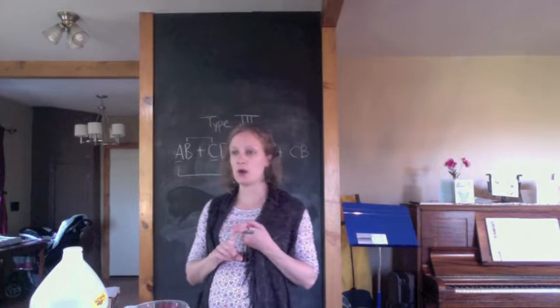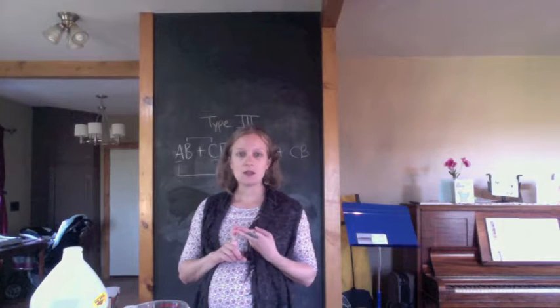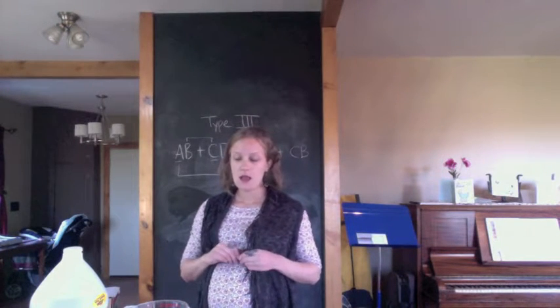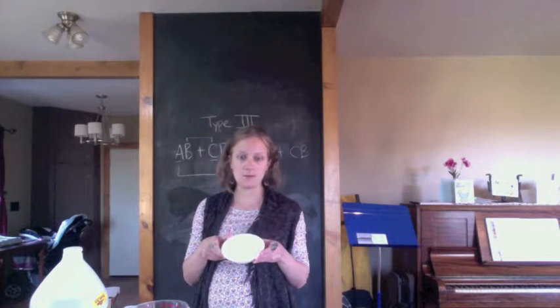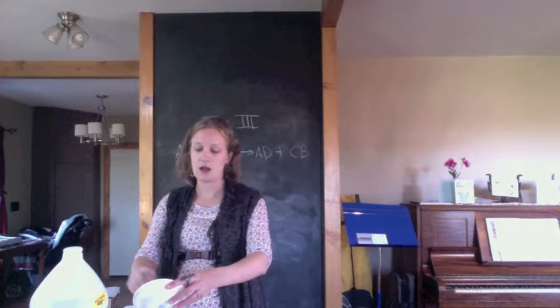The first, type 1, was precipitate, formation of a solid. Type 2 was acid-base, creation of water and heat by mixing acid and base. And type 3 is the creation of a gas. So here I have baking soda, sodium bicarbonate, and I'm going to put it in a container. I'm going to use a lot of it.